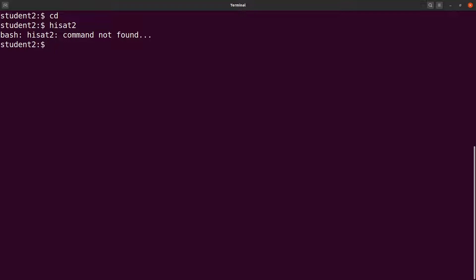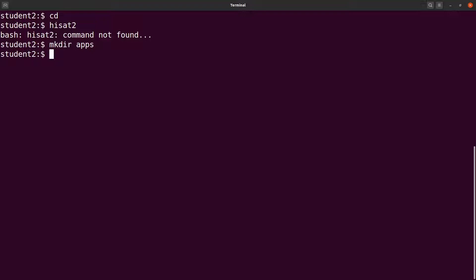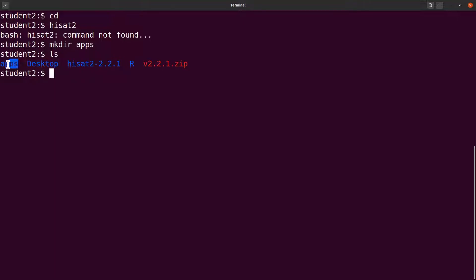What we are going to do is to add the path of HISAT2 to our environment so that we can always call it by the name and then get it executed. To do that, we need to first create a directory. We are currently in the home directory. I'll just create a directory called apps. I'll say mkdir apps. And then I'm going to move the HISAT2 directory into this particular apps directory. Let's do an ls first. We are going to move this one here. I'll say mv and then I'll specify the directory and then I'll move it here.